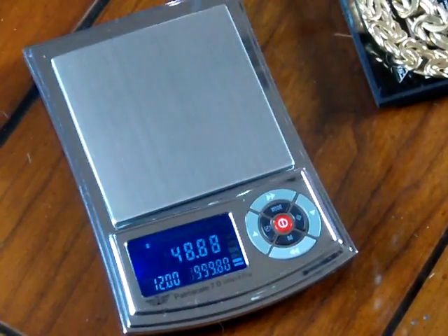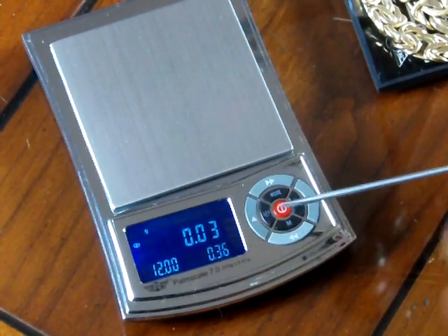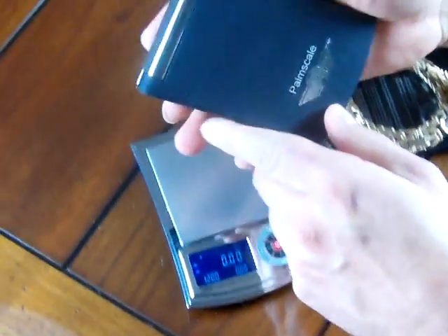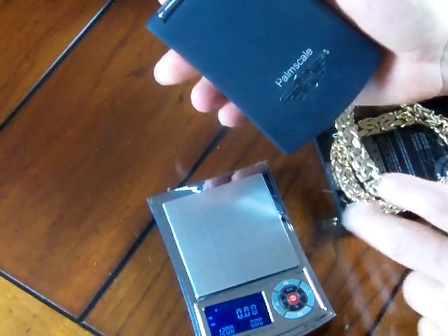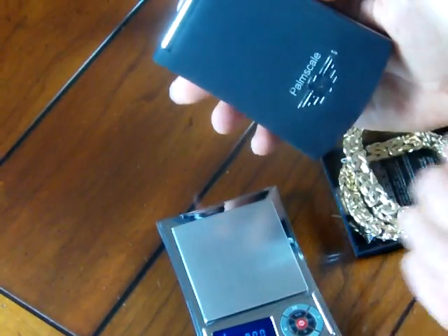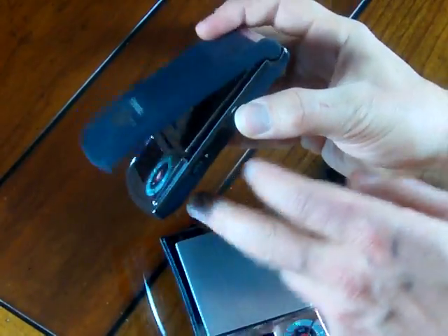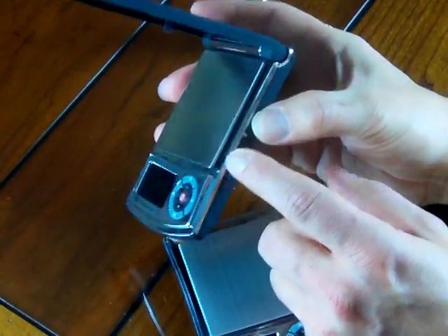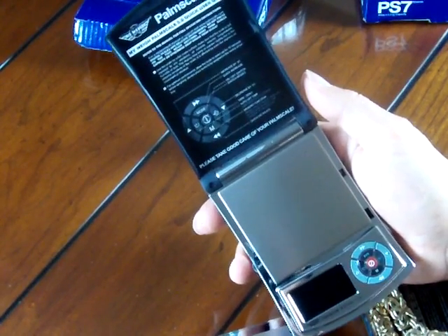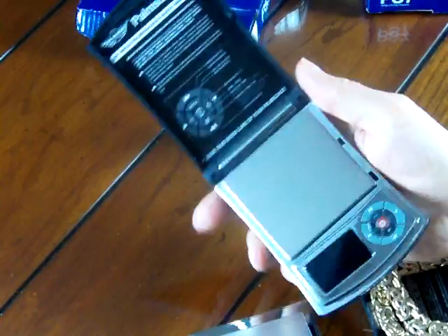This is the MyWay PS7 — 200 gram by a hundredth of a gram. MyWay also makes the MyWay PS8, and the difference between the two scales is that the PS7 we're demonstrating has a removable magnetized cover that comes off completely. On the PS8, which costs more money, it has a hydro hinge — there's a button on the side, and when you press it the cover pops up like so. The scales are very similar and have different weighing capacities. The functionality — the outer ring for price computing and the inner ring for scale control — are all the same.